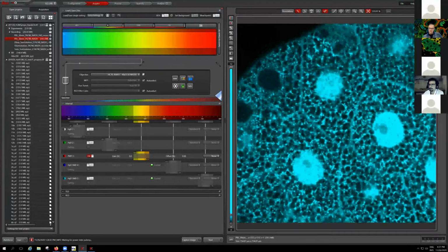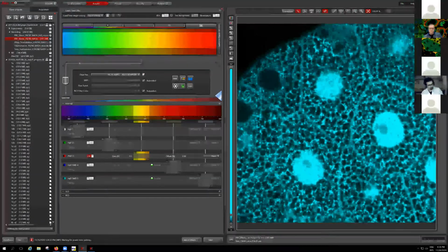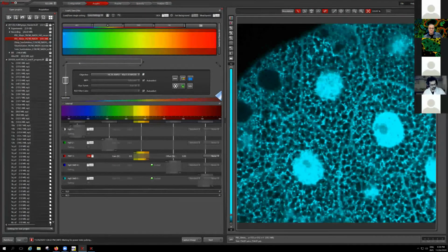For insect tissues, this is quite tricky, since insect tissues tend to be melanized, chitinized, and these are beautiful autofluorophores, which always give a strong background. But of course, the idea is a challenge to somehow go for this at some point, yes. But this was only a relatively simple, small test experiment here.